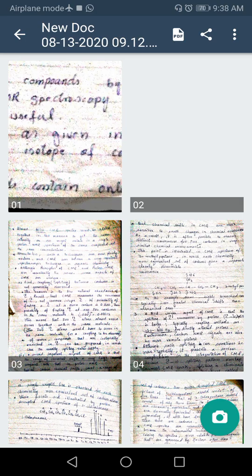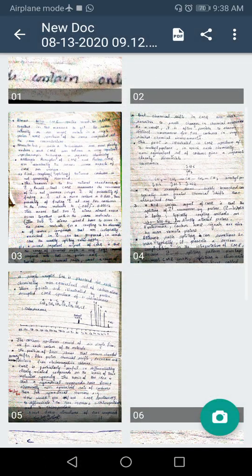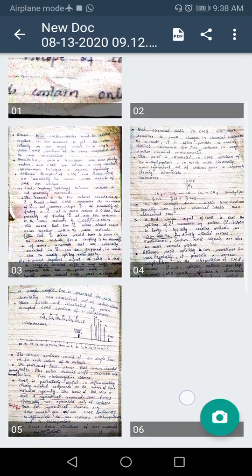Now you can see that we are taking many spectra of the C13 containing compound. Roundabout how many? 6,000 spectra of the carbon 13 NMR are taken, and they are added together to get the same intensity as that of the signal of the proton in the PMR spectroscopy.